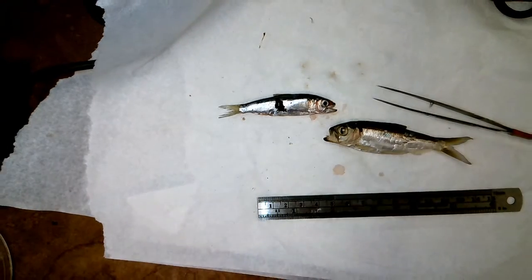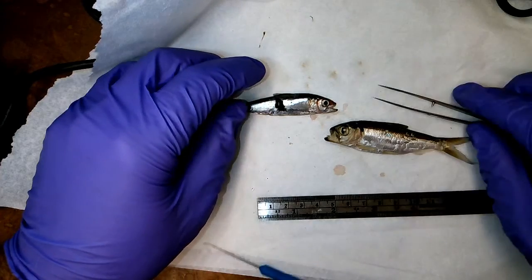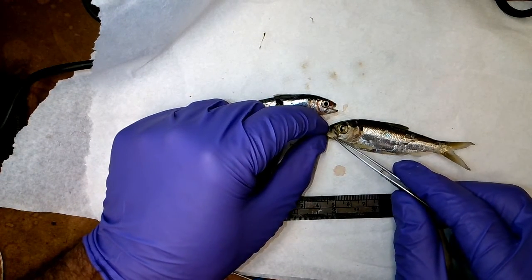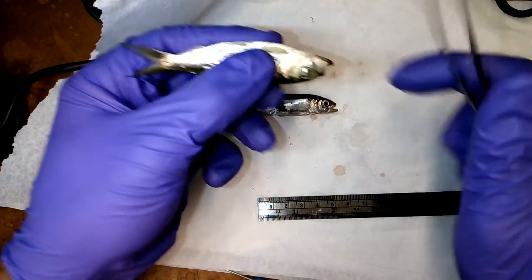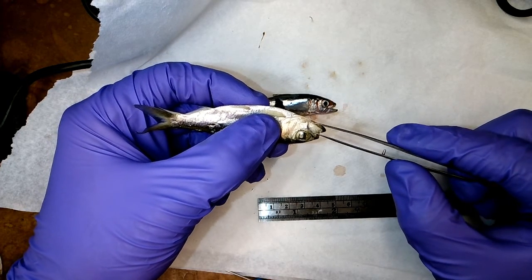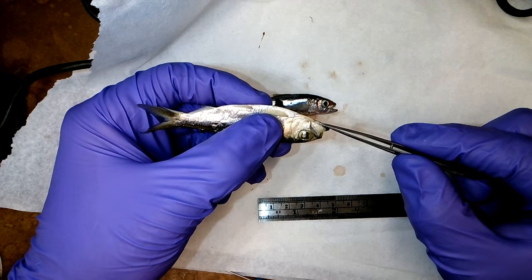When you're looking at the thickness of the upper mandible, so that's what I ripped off on another fish, but that's this flappy piece right here. Hold that up. Okay, there's the upper mandible. And we just want to look at the thickness of this.